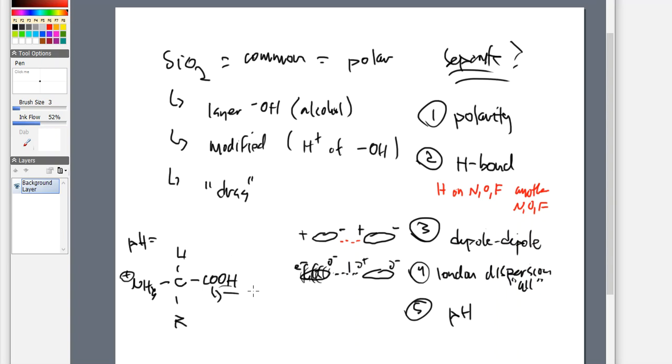Okay, at pH of 2, it's probably still COOH. And then when we go to pH of 3, there is a chance that this carboxylic acid group begins to spit off some protons. And then as we go to pH of 4, and 5, and 6, absolutely, that pH is going to determine how this molecule begins to change.